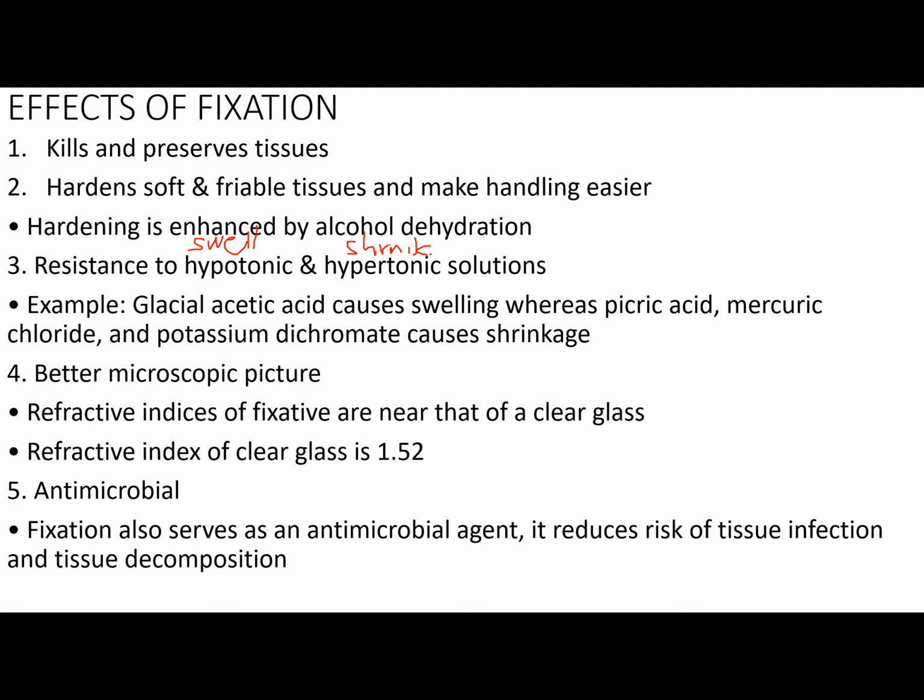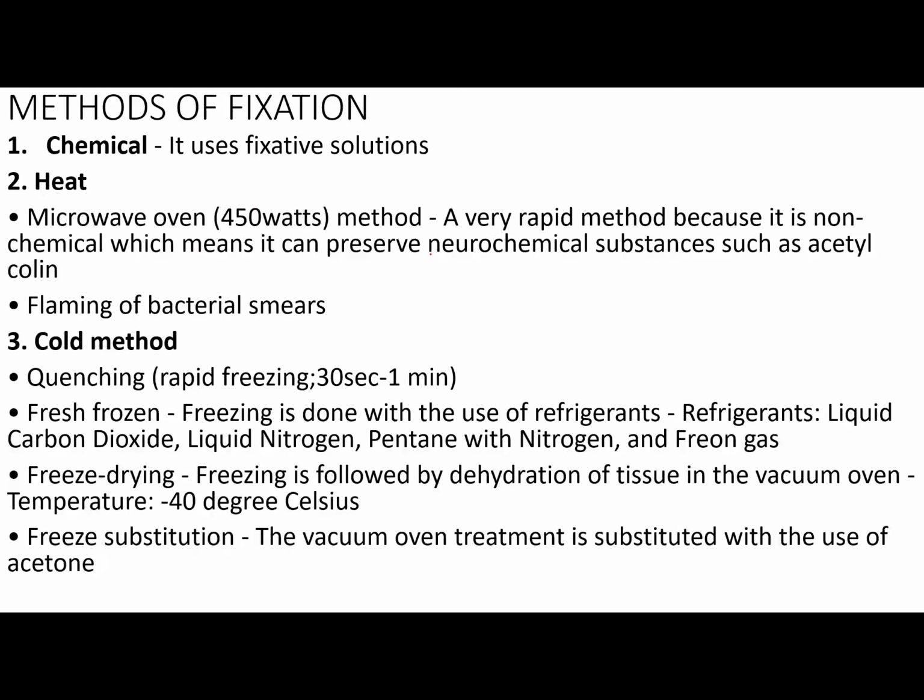And then the last effect of fixation, class, is antimicrobial. Fixation will also serve as an antimicrobial agent, reducing the risk of tissue infection and tissue decomposition. Now, what are the different methods of fixation, class? We have number one, chemical. So pag chemicals, you would use different chemical solutions. Then another method of fixation is via heat, specifically via the use of a microwave oven method.